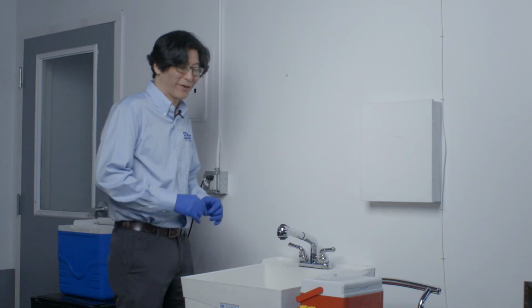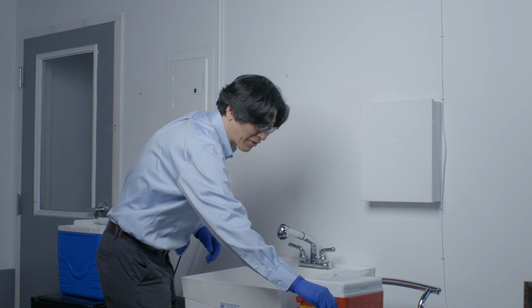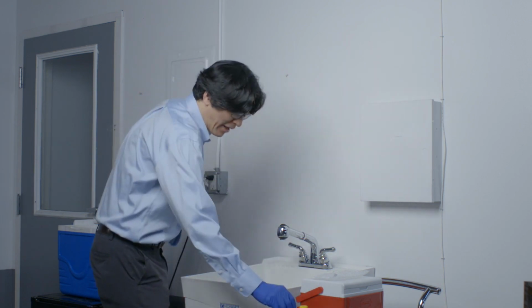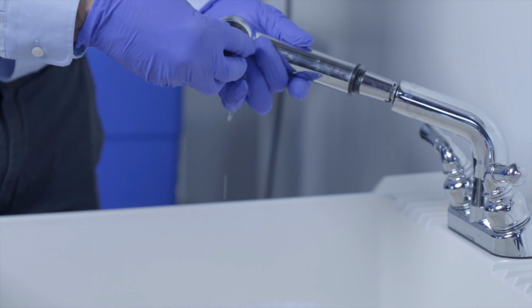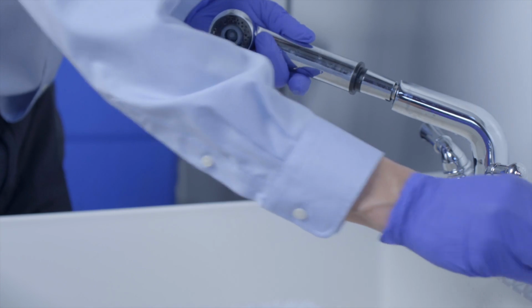All right, we're back here and ready to take our sample. Remember, we have our trip blank. That's just going to sit here and go along for the ride. So here I'm going to take our sample vial, and before we get going, we want to remove the aerator from our faucet. So I'm just going to take this off here. This creates bubbles and can really affect the sample, so we're going to take that off.